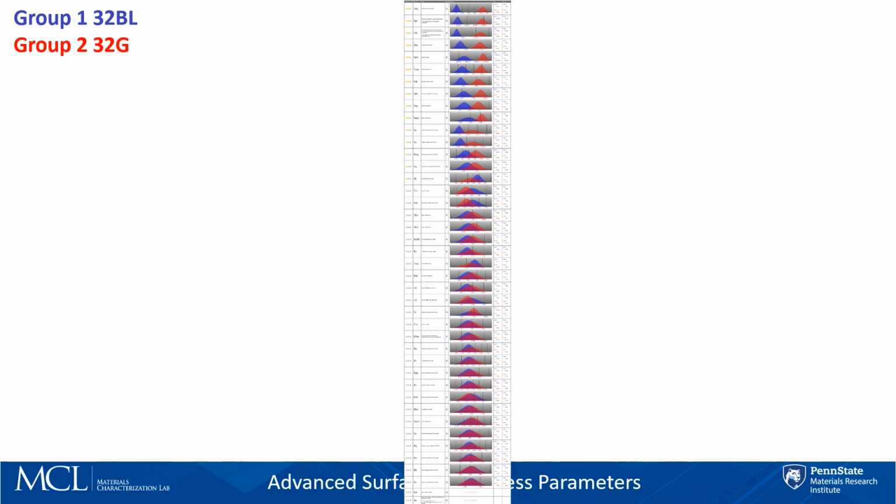So basically what it does is it averages the images and looks at the differentiation between these parameters in the sample set itself, and then compares the two different sample sets, and uses that as a comparison for what are the best parameters to define the differences between these samples. Now, I know that this is very hard to see. However, if you just use your eyes and go down the middle, you can see that up at the top here, these are the recommended parameters.